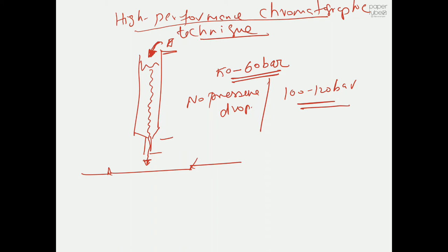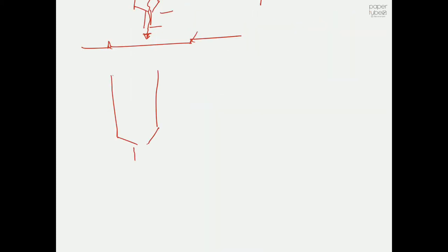So the main advantage is that anyone can work with this technique. Even if you don't have any theoretical knowledge of chromatographic techniques, if somebody gives you the set of procedures, you can just go to the lab, fill the solid material, add the solvent, and add the compounds that you want to separate. So it's a very easy technique to perform at lab scale and also at industrial scale. The scale-up of the process is also very simple: all you need is to increase the diameter and length of the column. It's also very easy to downscale the process by changing the column height and column width. So these are some of the key advantages of chromatographic technique.